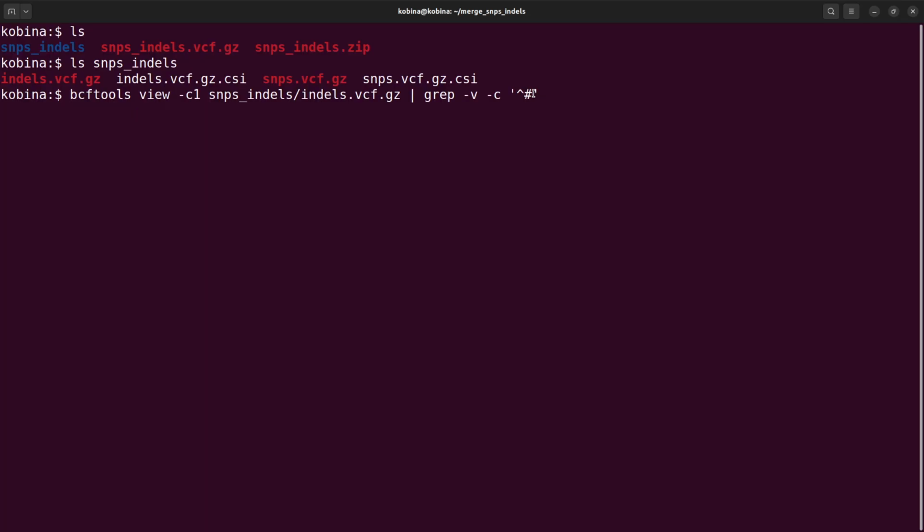All right. So in the VCF file, you have lines that begin with hash. Those are not variants. Only the lines that do not begin with this hash character or symbol are the variants. So that's what we are looking at here. So we are counting those lines that do not start with hash. All right, so let's count and get the number. Perfect. So there's the number that we have, 12596.